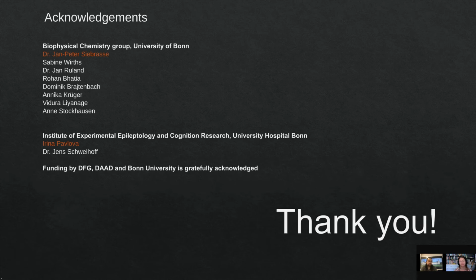Well, maybe that's something that I forgot to mention. All the images that I showed are raw images, so they don't have any post-processing. They are of course stitched because we take several tiles, but they are not after deconvolution yet. The idea was to show what you are able to get just by applying the technique and getting it from the microscope. Great, thank you.